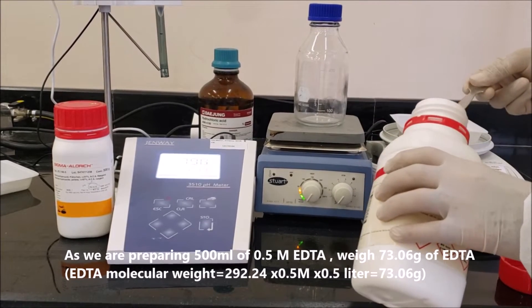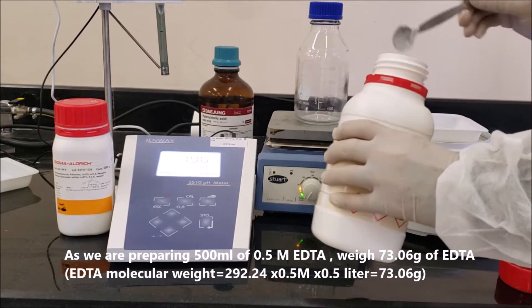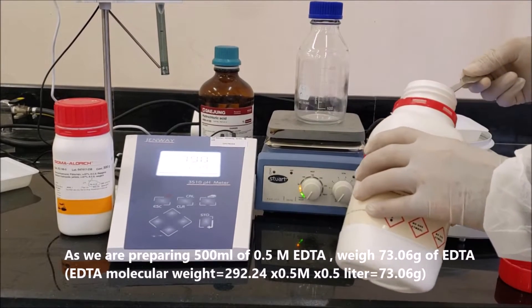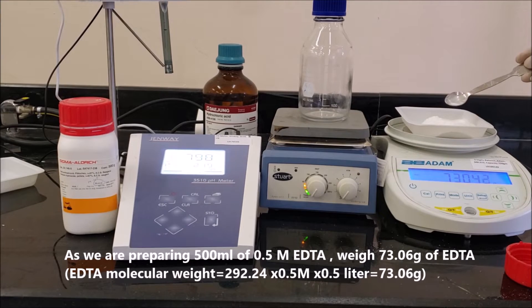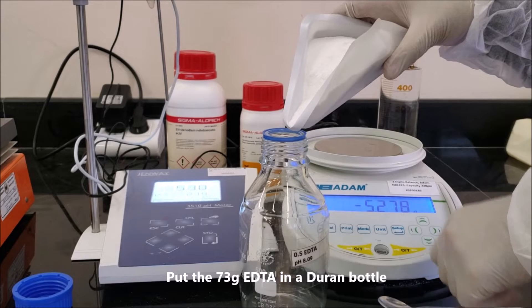As we are preparing 500 ml of 0.5 molar EDTA, weigh 73.06 grams of EDTA, which is the molecular weight times 0.5 molar times 0.5 liter. Put the 73 grams of EDTA in a Duran bottle.